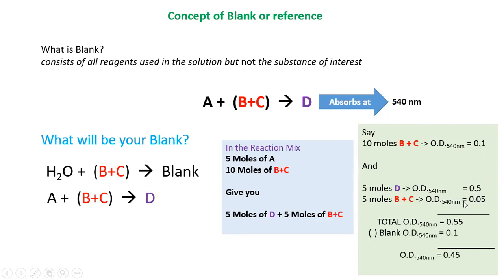So the question that was put forth in front of you, after we understood this calculation of extent of absorption by your sample and extent of absorption by the components of blank, the question that was given to you was: is your blank really a good blank?